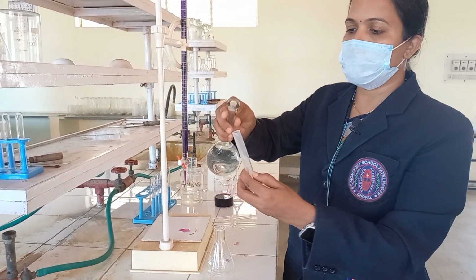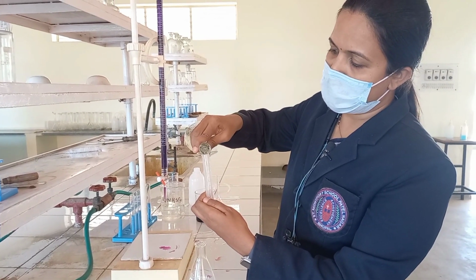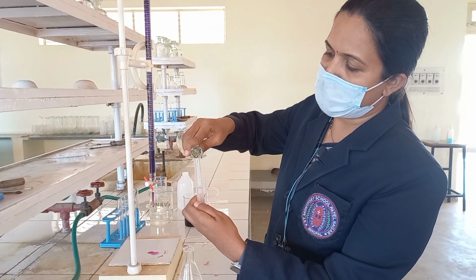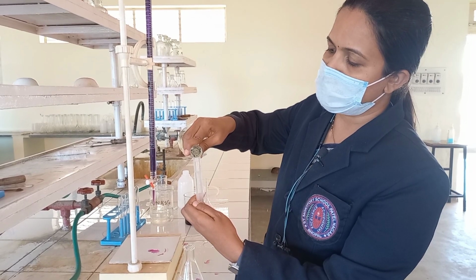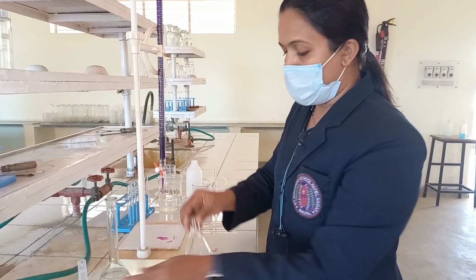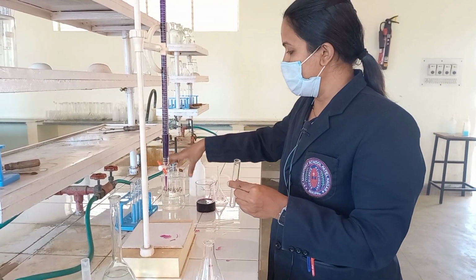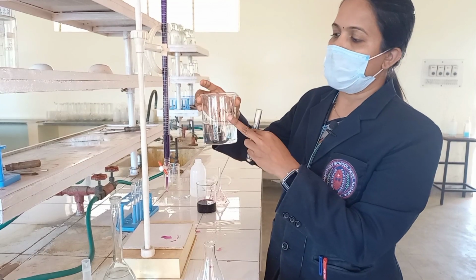In a small measuring cylinder, just pour 10 ml. Measuring cylinders have all the marks, so just pour the standard solution into the measuring cylinder. After pouring it, you can transfer it into the flask. As I have already taken it with the pipette, that's why I am not taking it another time.